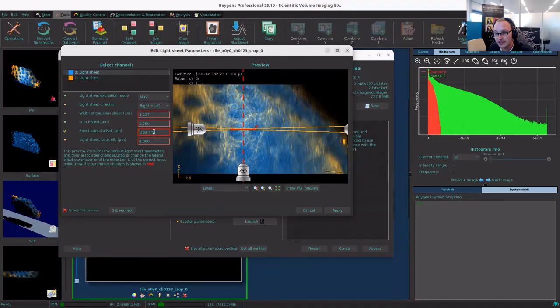There's a question: do we need to supply an .mvl file with the Zeiss LS7 data for multi-angle fusion metadata? I apologize, I have to pass that one on to my colleagues. We have different ways of reading in the positional metadata from the different views. I will forward that question to my colleagues, and you'll have your answer next working day here in the Netherlands. I'm just not 100% sure which metadata we read in for that, but we have multiple ways of doing that.